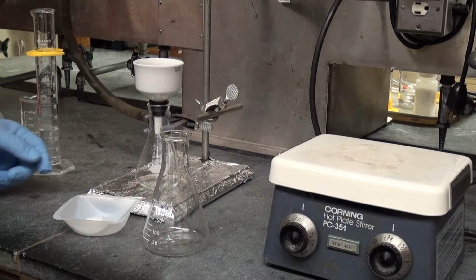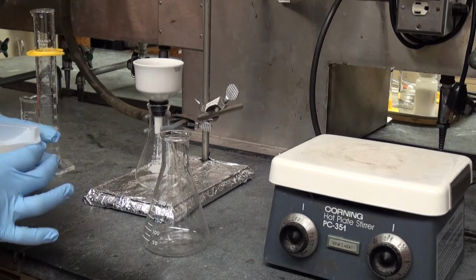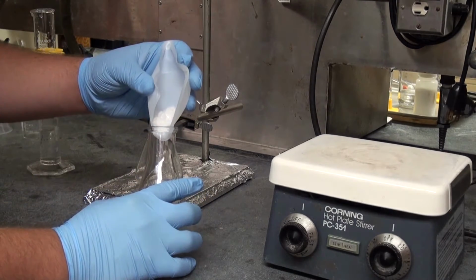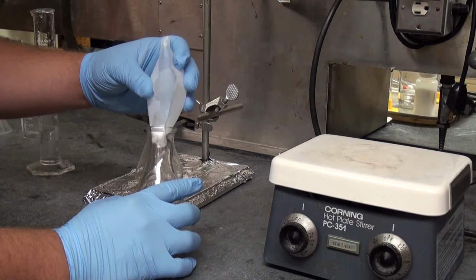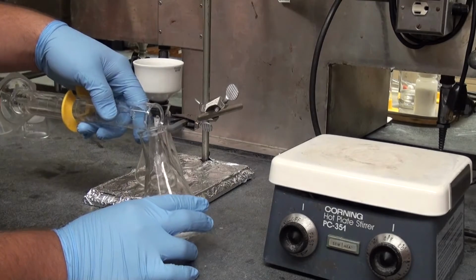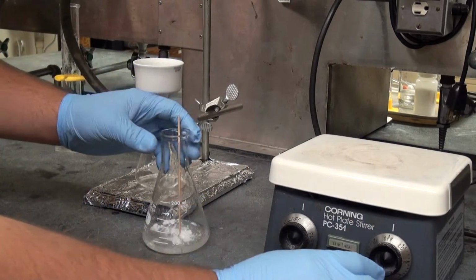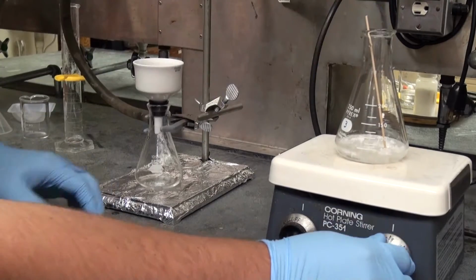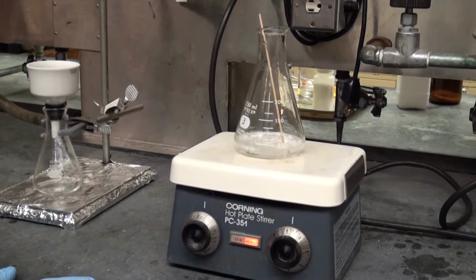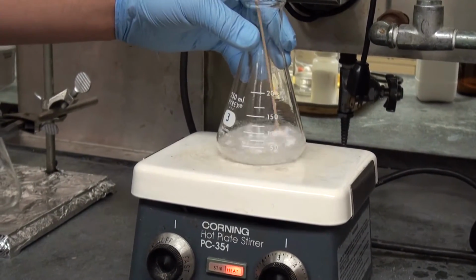You first have to dissolve the solute. For that, weigh about 1 gram of benzoic acid and write the exact weight in your notebook. Add the weighed benzoic acid to an Erlenmeyer flask and add the appropriate amount of water you calculated before you come to lab. Add a boiling stick to the solution and heat gently to boiling on a hot plate. Swirl periodically in order to promote dissolution and prevent bumping.